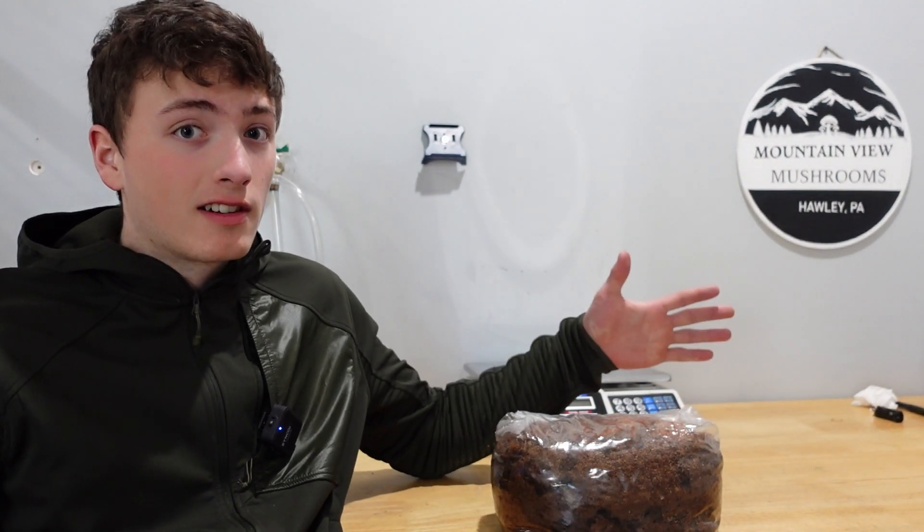Can we inoculate a sterilized mushroom block without any sterile technique, no HEPA filter, and no still air box? Let's find out.